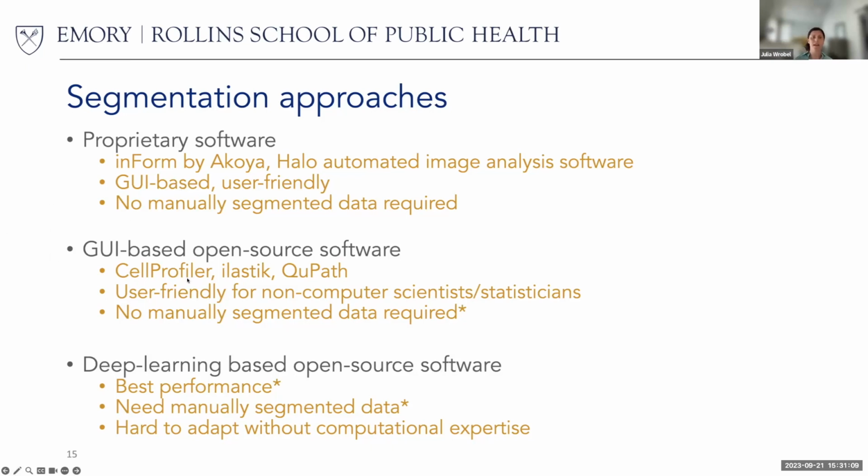Then there's also GUI-based open source software, which is also user-friendly and often doesn't require a gold standard. And I think that some of the groups I've worked with like to use these because they're a little bit more transparent in how they work. And then finally, unsurprisingly, the best methods for cell segmentation typically are based on deep learning. But they require lots of manually segmented training data, and they can be hard to adapt without computational expertise.